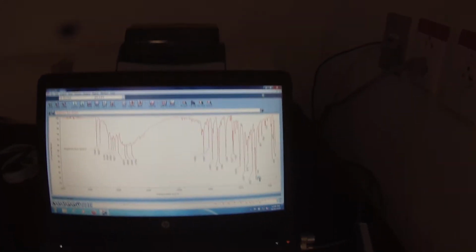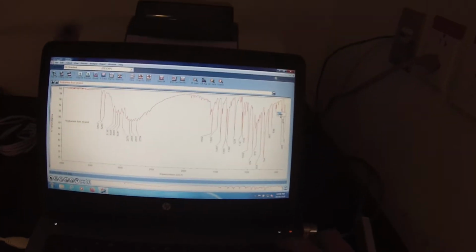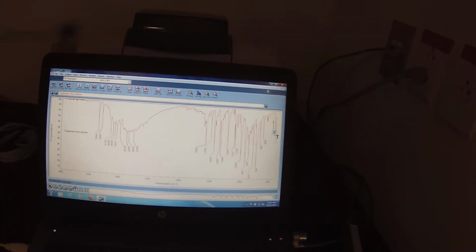And then hopefully we'll be able to compare those to the literature. This is just a shoulder. Get rid of that one. 144. 534, 575 is obviously not significant. And then these peaks in the 400 range, we never care about those. Those are artifacts. So that's looking nice. Let's save that again.